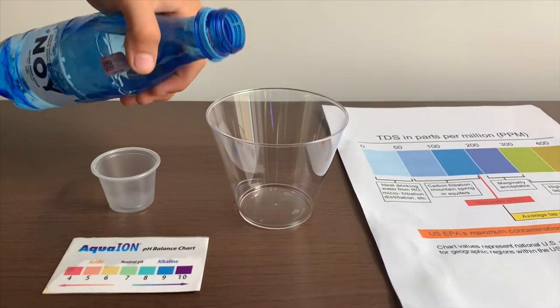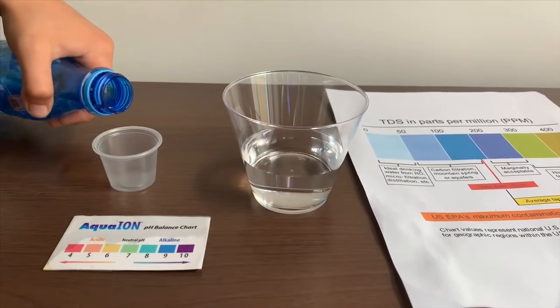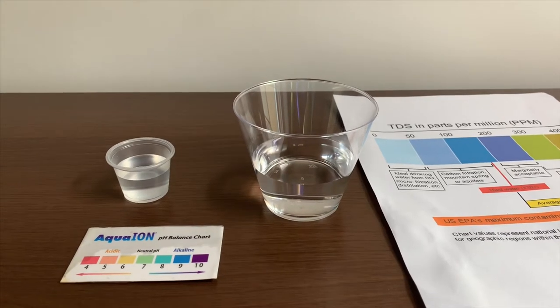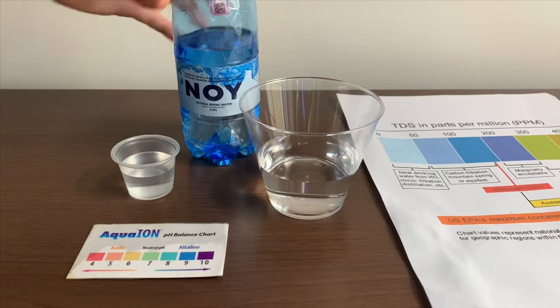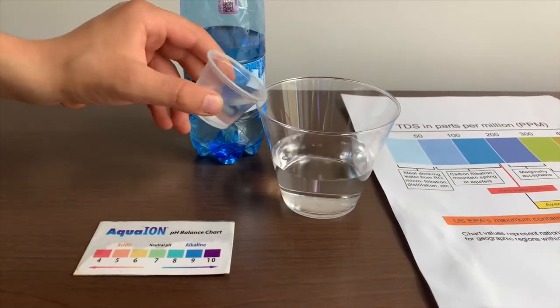Let's pour some water in. This is a little too much for the TDS pH cup. Let's pour some back in the TDS.